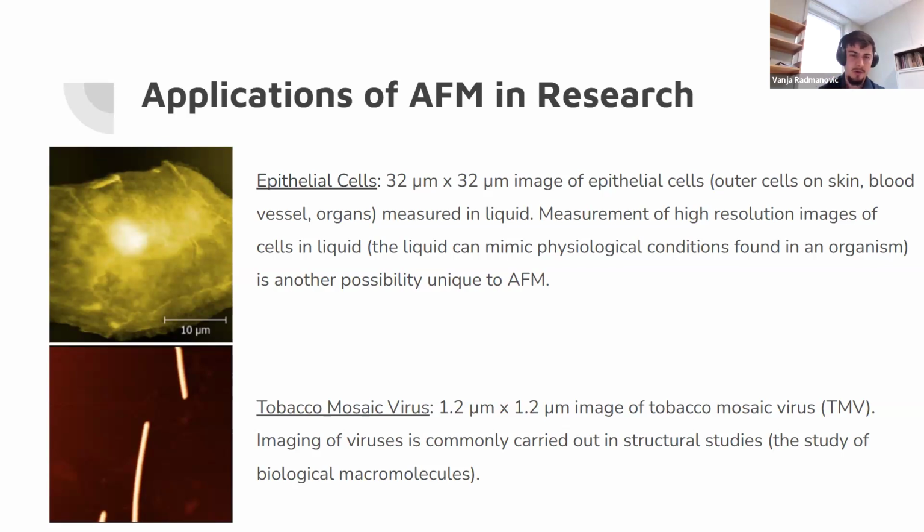And then also on the bottom left, we have a 1.2 micrometer image of the tobacco mosaic virus. So it's also possible to image viruses, also in the study of other biological molecules.